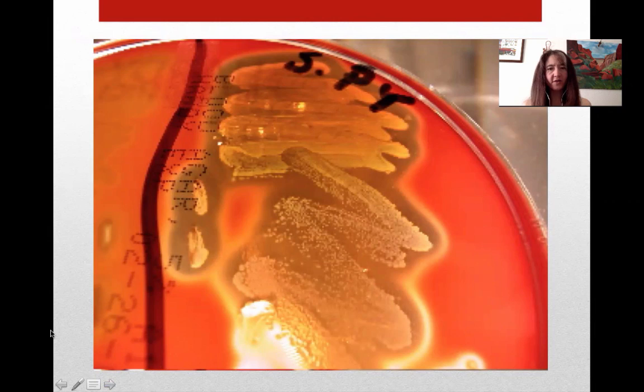Also recall that on the throat swab plates, you not only streaked them, but you also stabbed them. So after streaking half of the plate, you kept a certain amount of culture on your loop, and then you stabbed deep down into the agar. This particular image shows the base of those stab marks for a plate that was streaked with Streptococcus pyogenes. Remember, the strep throat causing bacterium.